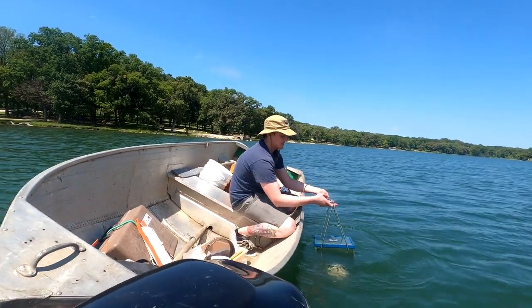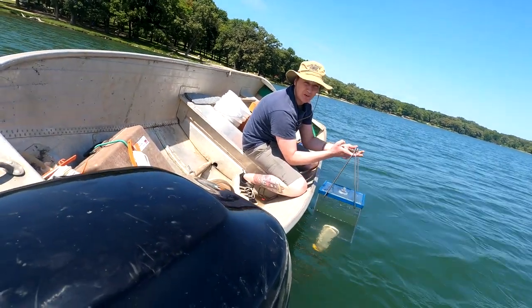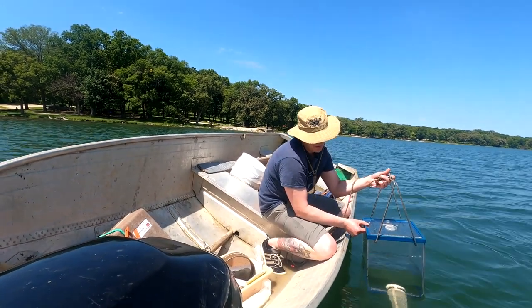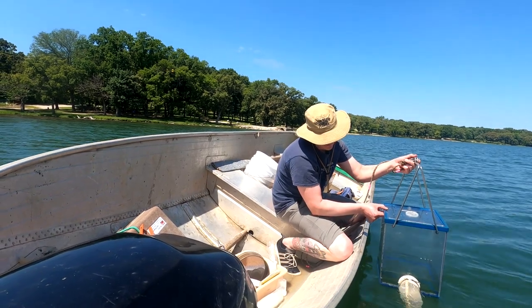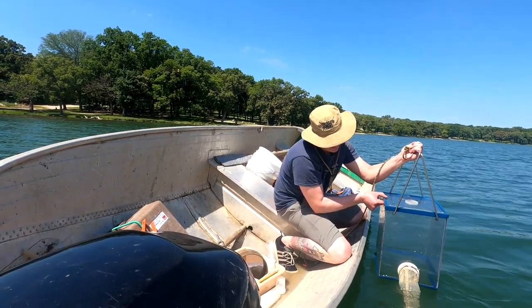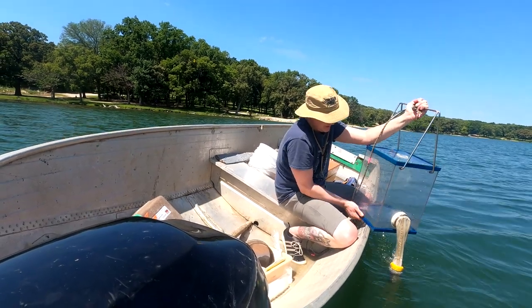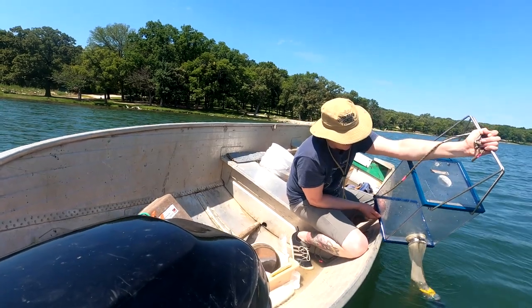Now that it's at the top, I'll pull it slowly up. We have time for the water to drain through. You can actually hear the air hissing in there. Now I'll put it up on the edge of the boat.